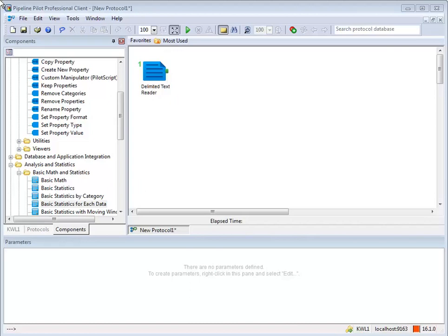Now, we'll build a protocol using the various methods there are for adding a component to a pipeline. Components can be dragged into the protocol building workspace and dropped onto the end of a pipeline.